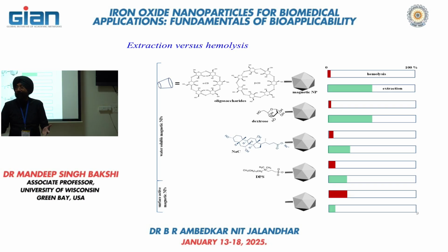I'm not sure, at least immediately. Maybe after some time, they may use such technology rather than centrifugation of your blood sample to extract the blood cell, perform the test, test the serum, and for any other purposes. This is a new kind of technique, a methodology that can be easily used and is much easier in comparison to centrifugation.